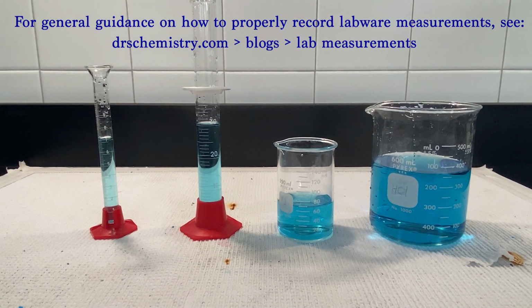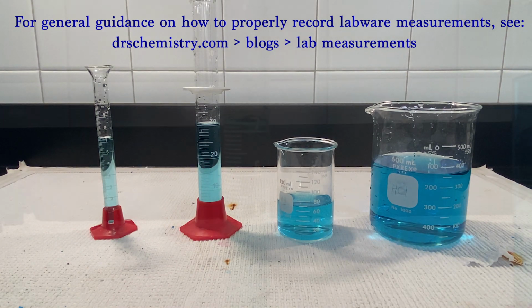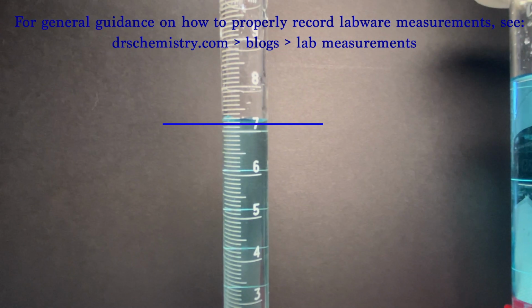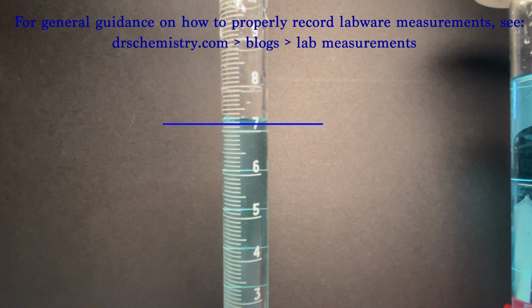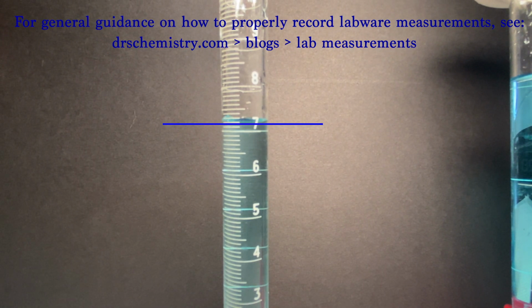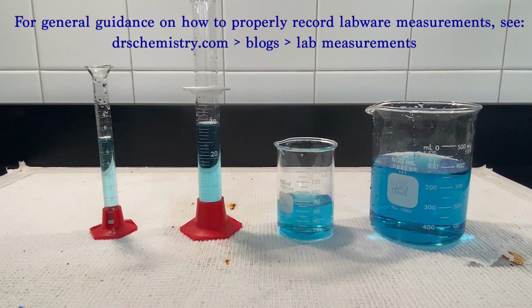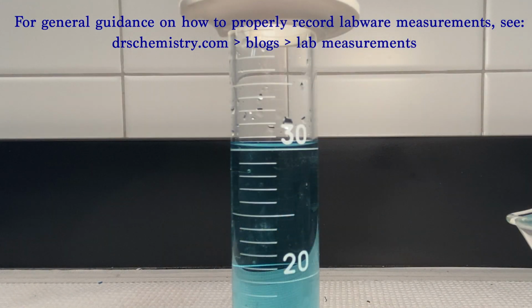Here, the challenge is to record those measurements to the proper number of sig figs. For some very important guidance on that, be sure to see our web page, the blog section, and scroll to the bottom and click on Lab Measurements. There you'll be taken to a page that gives you a very good explanation on how to properly record those values, as well as some sample readings.